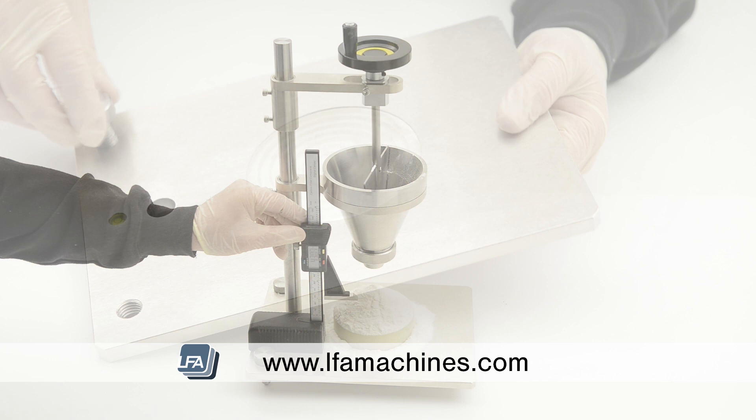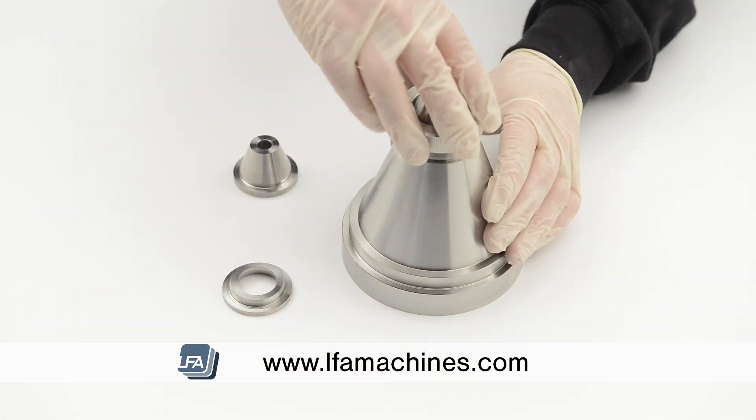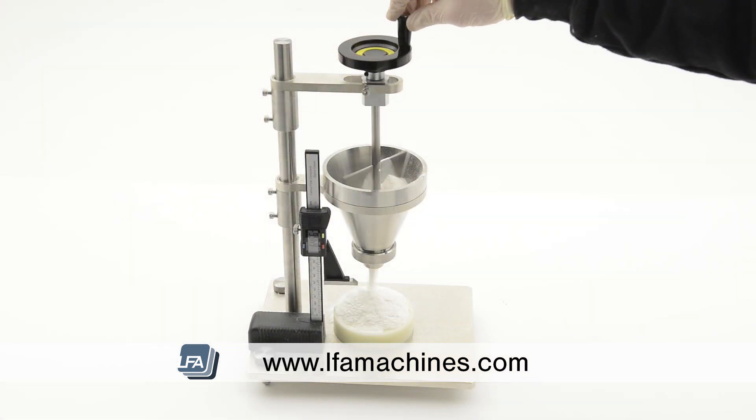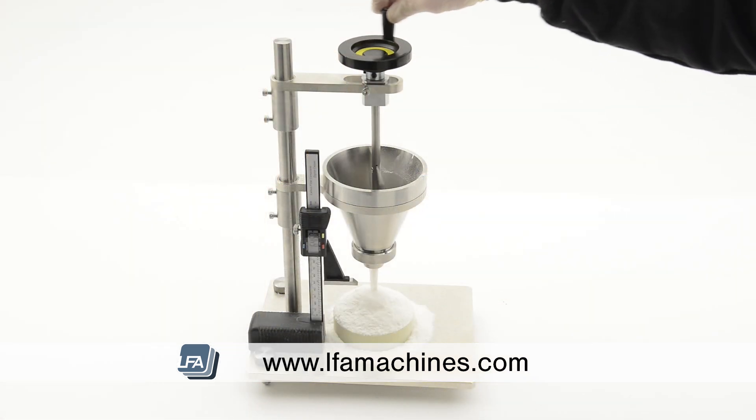Simple design and easy to construct, the LFA ART1 can be set up in minutes and training is minimal. LFA will supply documentation and videos on how to set up and use your apparatus.